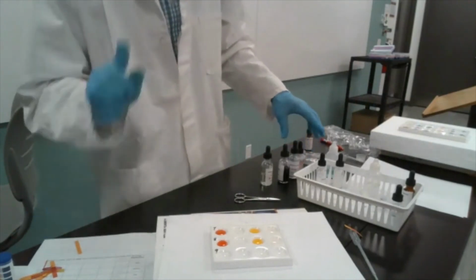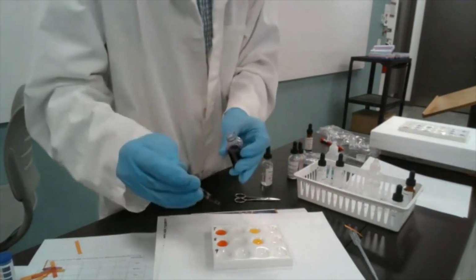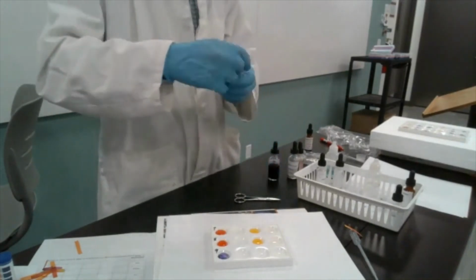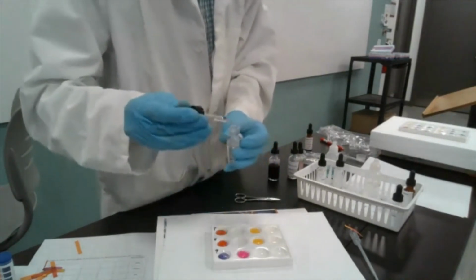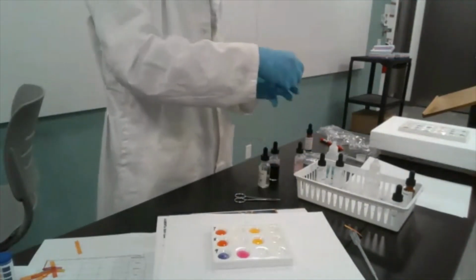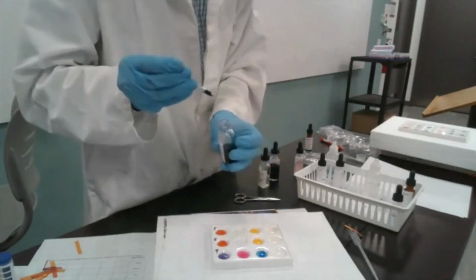Let me see, milk. So let's add litmus first, followed by phenolphthalein, followed by bromothymol blue.